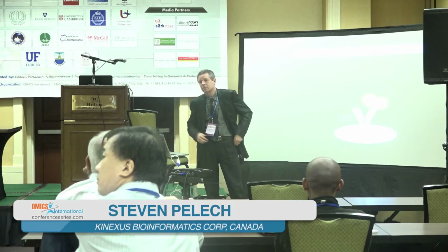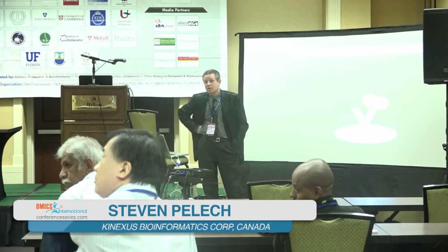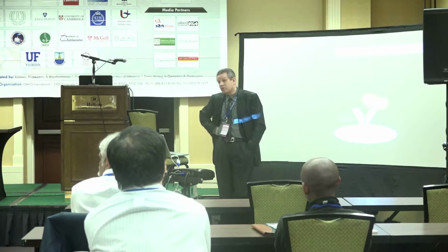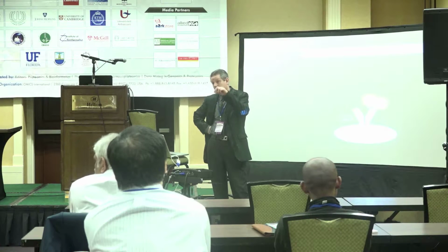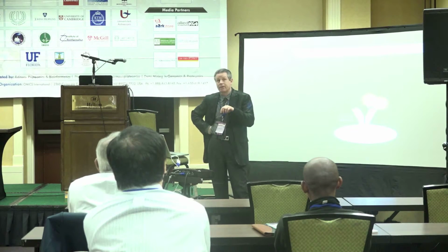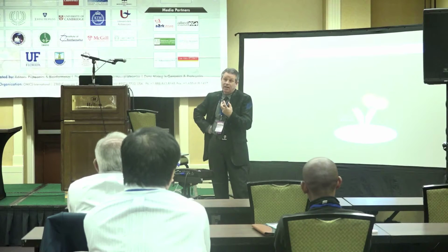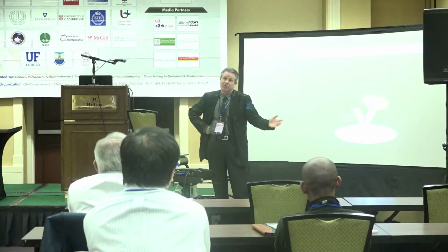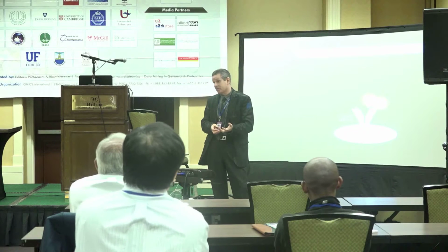So in your experience, is the KD of the antibody and the peptide relatively the same? I wish it was. The antibody KDs vary dramatically. We try to adjust for it by the level of the antibody that we put onto the array, because we don't want to have a super high affinity antibody for a protein that's in high abundance. Then we get a signal that's super strong, and the scanner kind of gets confused and ignores the weaker signals. That's why we have really good dynamic range. We can get very weak signals.